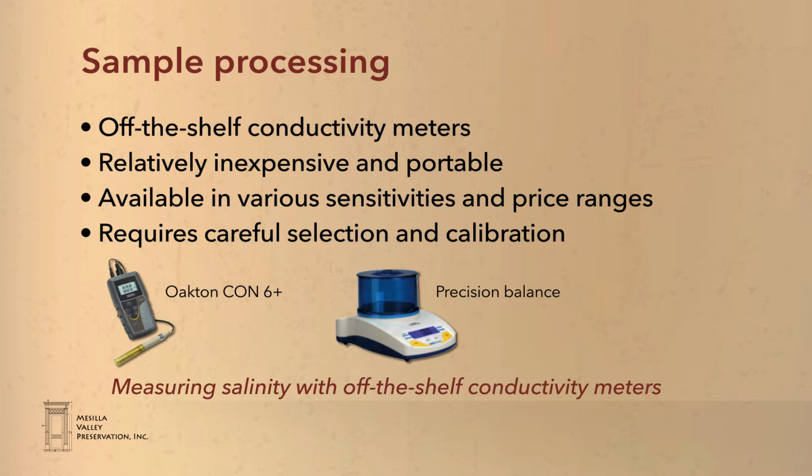For example, distilled water has essentially zero conductivity, while seawater has substantially greater conductivity. It is important to choose a meter that is sensitive in the desired range. The meter used in our preliminary testing was an Oakton Con 6 Plus handheld conductivity meter.